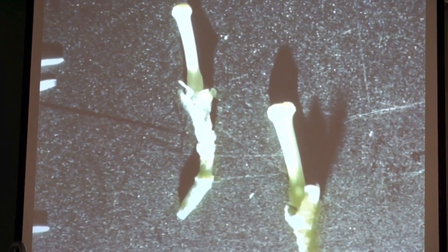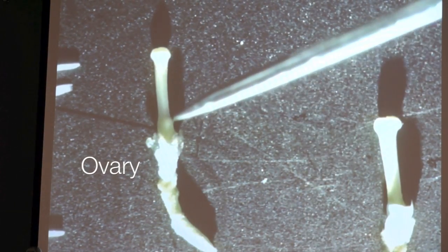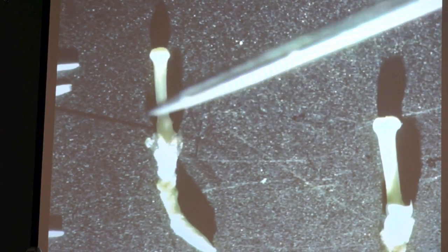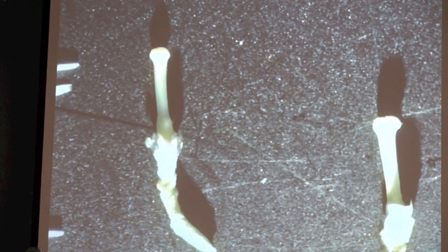Now we can see all the parts: that's the ovary, style, simple stigma. I'm going to cut that one across to see how many chambers are there.